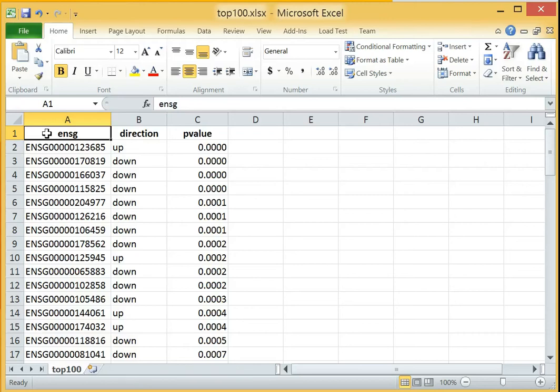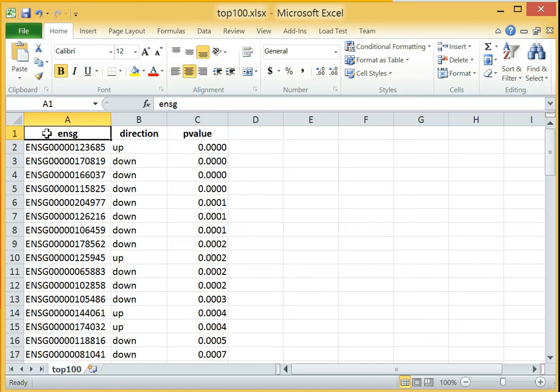We develop an ID mapping tool which directly integrates into Microsoft Excel. As such, it empowers scientists to extend the data with identifiers and annotations such as gene symbols or gene ontology terms without the need to export and upload the data to some external service.